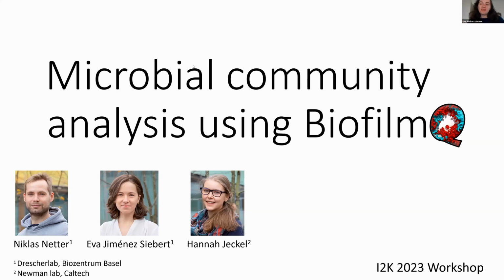I'm very happy to be giving this workshop today about basic analysis using our custom software BiofilmQ. My name is Eva Jiménez-Siebert, and I'm a PhD student in the lab of Professor Knut Drescher in the Biozentrum of Basel. I'm going to be talking today about microbial community analysis, basic analysis using BiofilmQ.